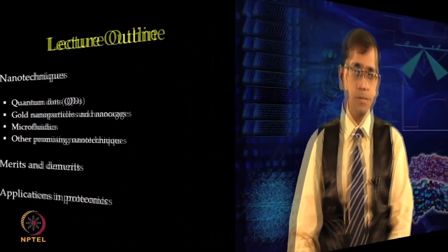In today's lecture, we will continue our discussion about nanotechniques in proteomics. We will discuss a few nanotechniques such as quantum dots, gold nanoparticles and nano cages, and microfluidics.